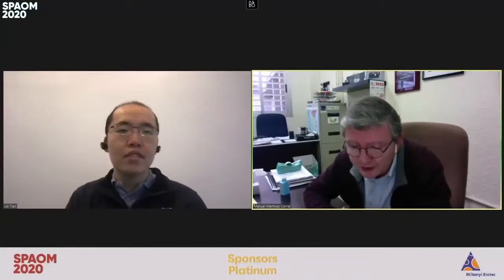Okay, I have a quick question from Julian Colombelli. I will read it for you. Nice talk, of course. You mentioned a working distance of 1 centimeter. Is there a way to easily shift or modulate this distance axially to repeat volume measurement closer or farther without moving the camera chip position, and to extend the overall imaging volume even if at the cost of several imaging iterations? Even more, any electronic or electro-optical component that could be inserted to do this?